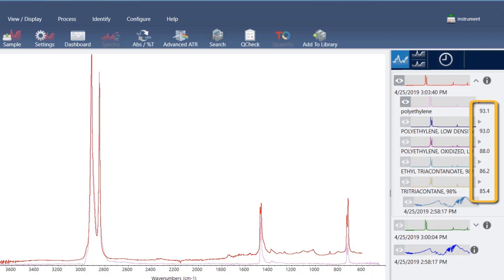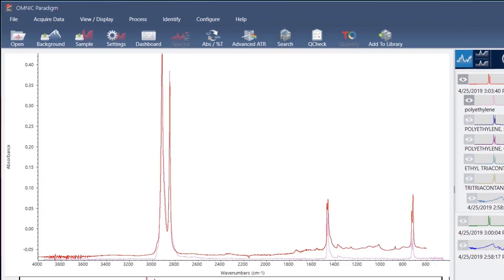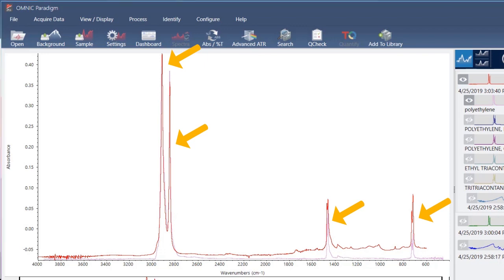In this example, the top two matches represent the same material from two different libraries. They both have match values that are above 90, which indicate good matches. The match value for the next spectrum in the list is well below that. If we look at the overlaid spectra in the spectral pane, the positions of the main peaks line up along the x-axis, and they differ only in their peak heights.